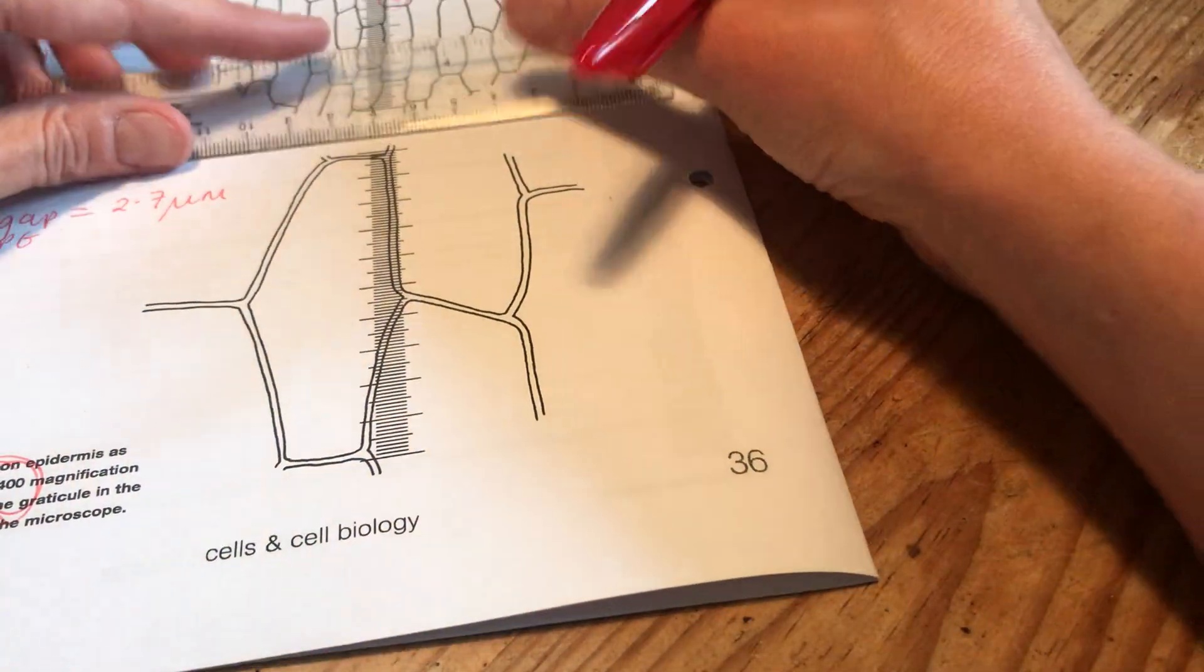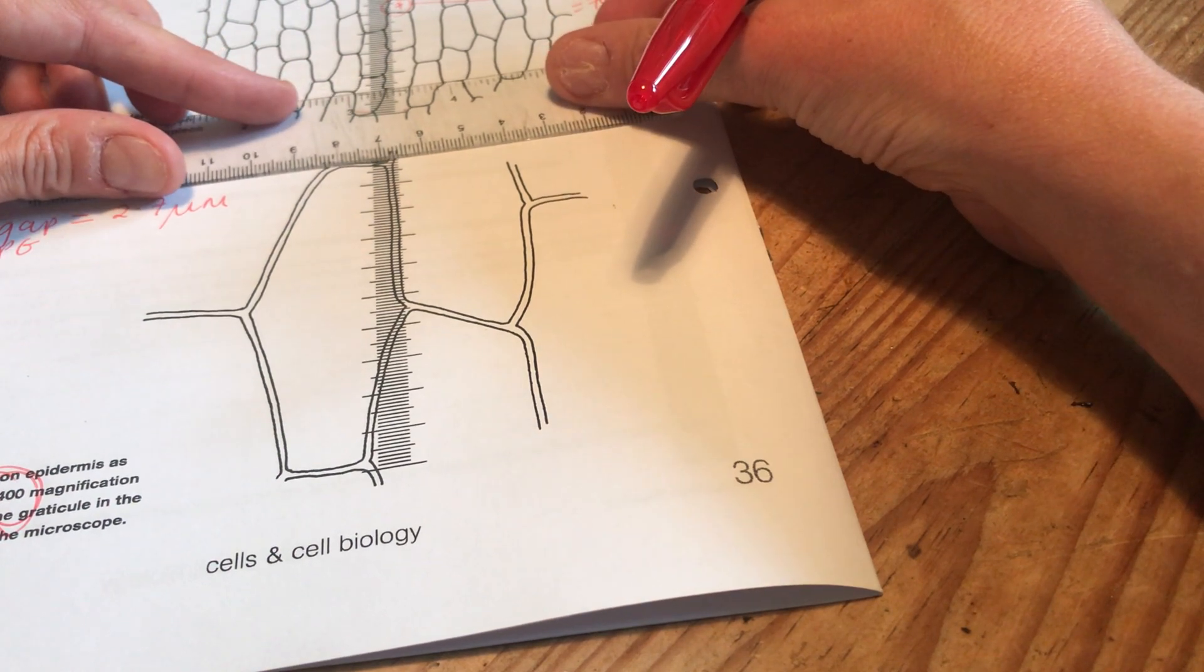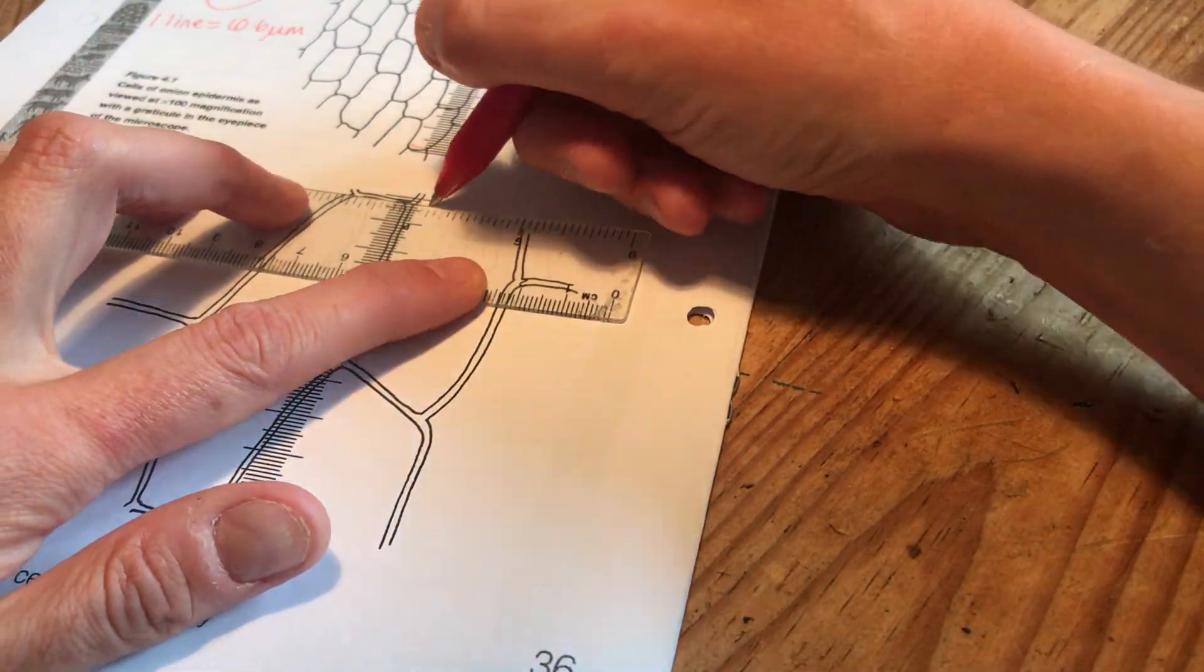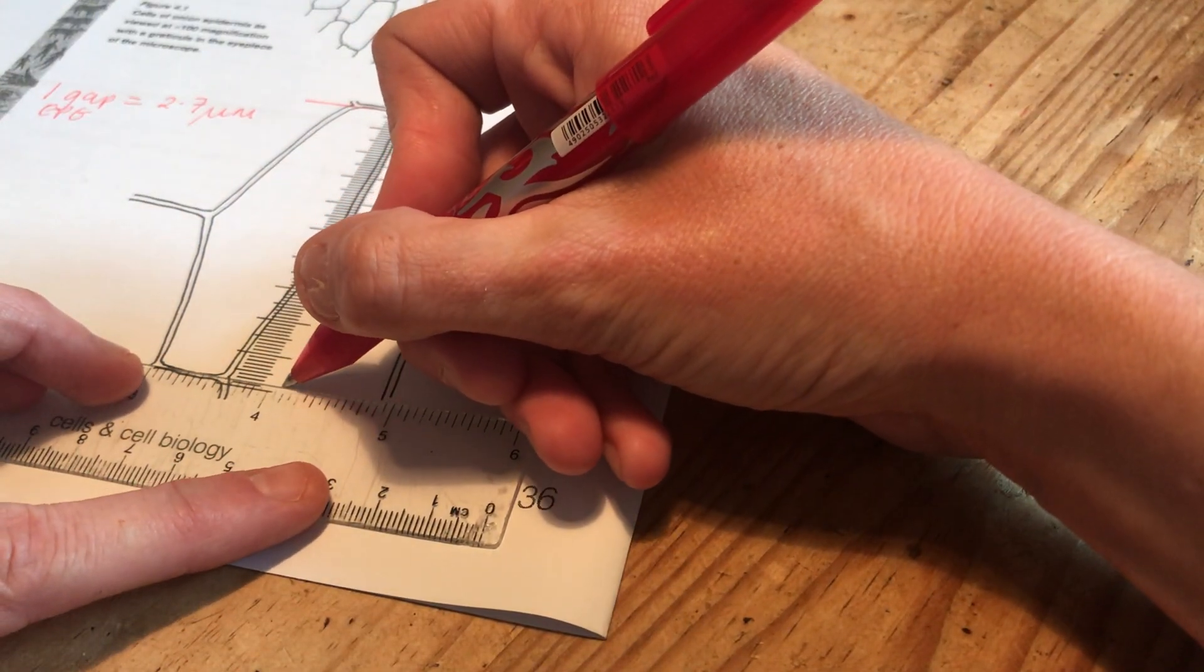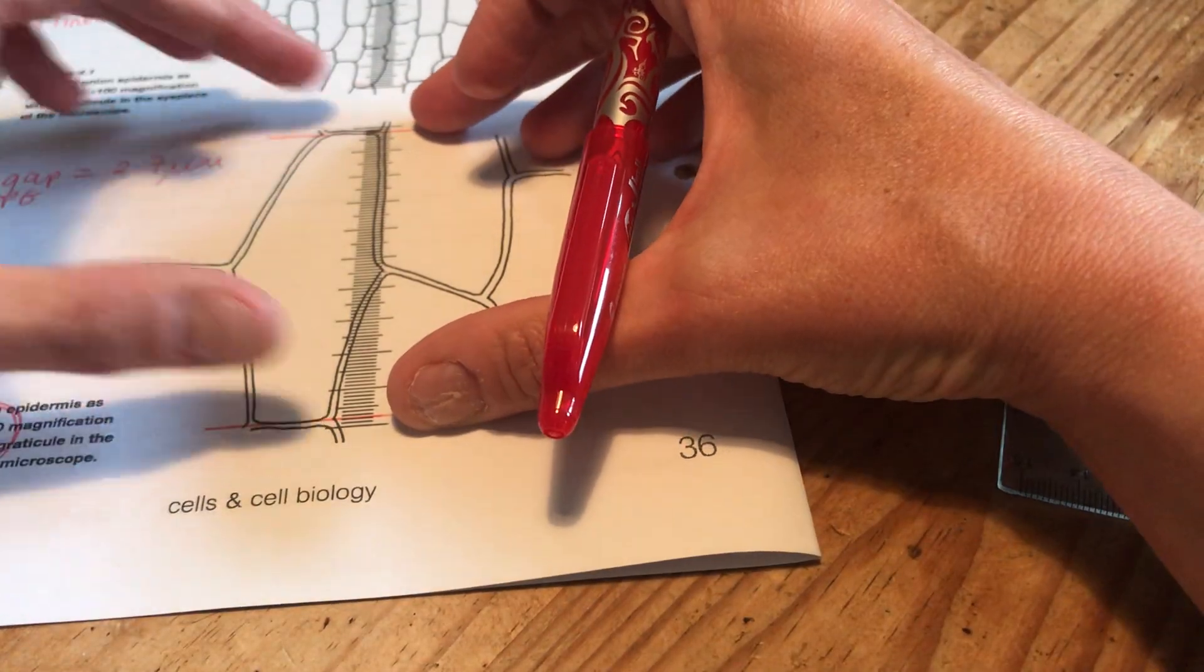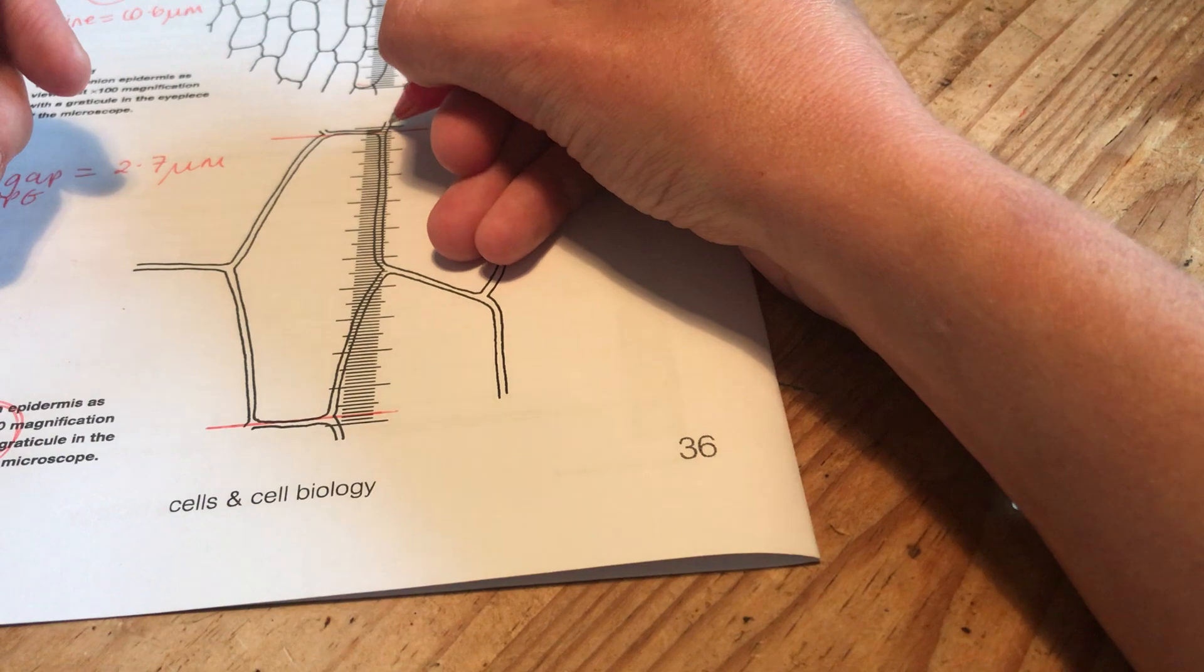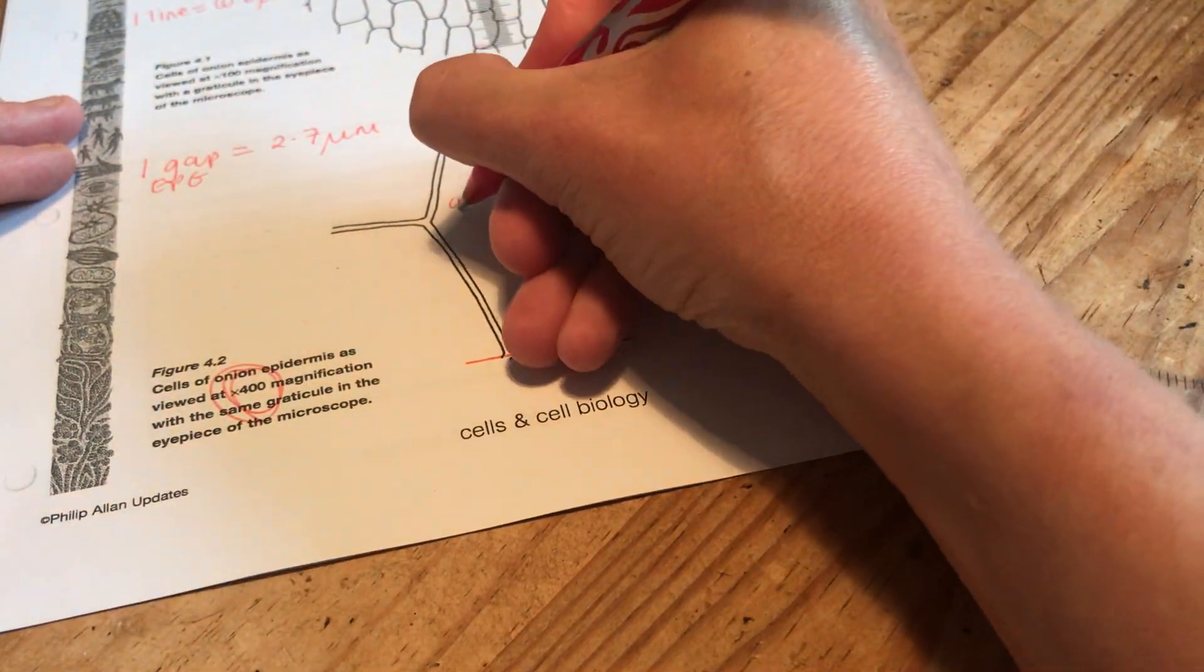Right. What does one of these cells measure? Well, it's like, where do you start? Where do you stop? Should we go for the inside line or the outside line? It's a bit open to interpretation, isn't it? There will be a bit of a margin for error in an exam. Don't worry about this. So I know the whole of that gap there, the whole of the eyepiece graticule is 100 lines. And this pretty much takes up all 100 lines apart from one, two, three, four of them. So I'm going to say that this cell is worth 96 gaps.